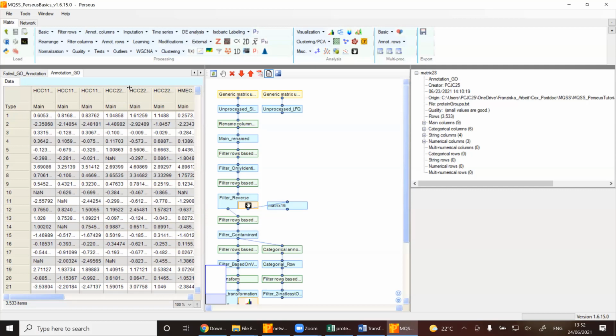And since we're not a commercial company, we cannot keep track that this will not cause any conflicts at the end. So the best thing to do is, once you have your zip folder, store it somewhere you'll find it again. And then I would also recommend to save the name of the version with your file name when you save your session, so that you can reopen it every time again with this Perseus version.